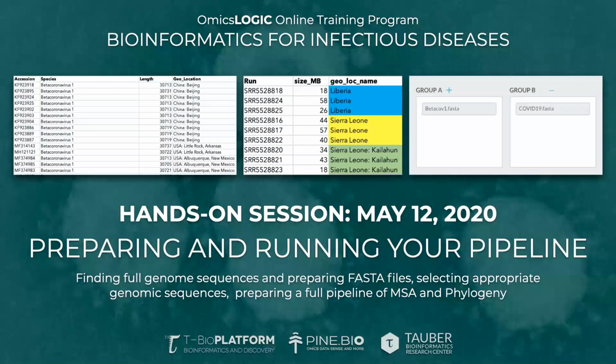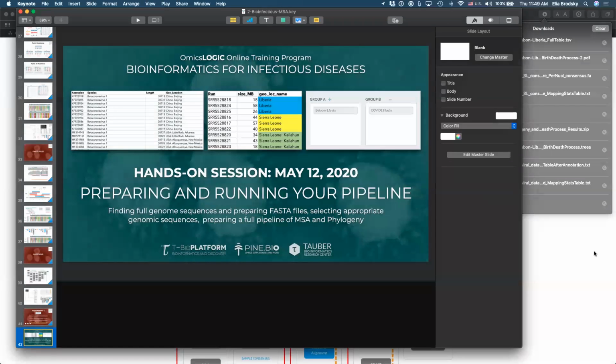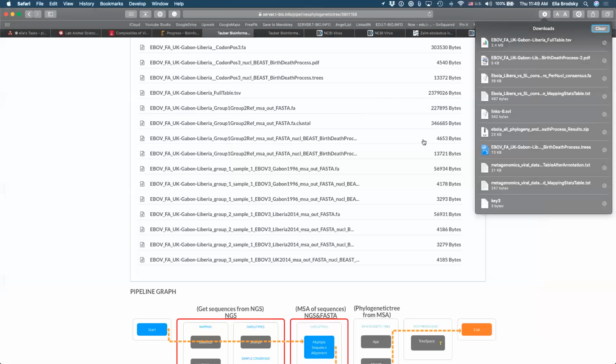Okay, and for Claudia, it is difficult to see your screen and simultaneously open the server web for doing the pipeline. Yes, I'm sorry, I understand that. And so that's why we'll spend next session doing it very slowly and making sure that all of you that are participating can do the exact same steps, and I'm not rushing ahead. And also, if you view this recording that's going to be posted very soon, you can pause and try to do those steps and run the pipeline, and we'll actually comment on your pipeline if it wasn't done the right way or there was some issue.